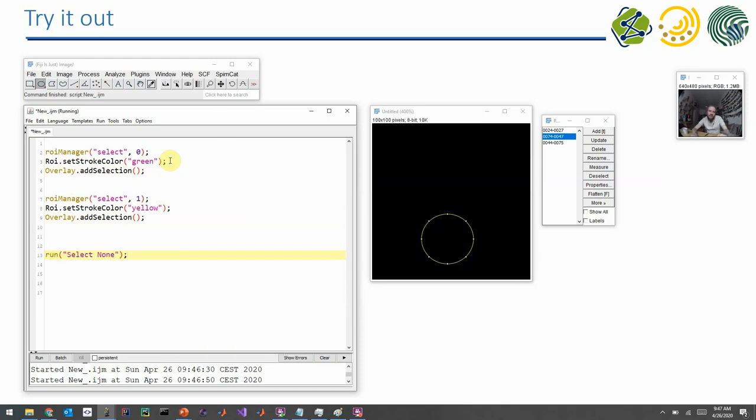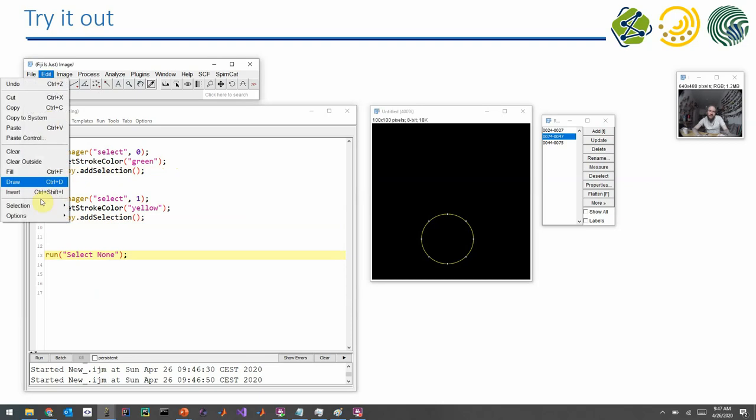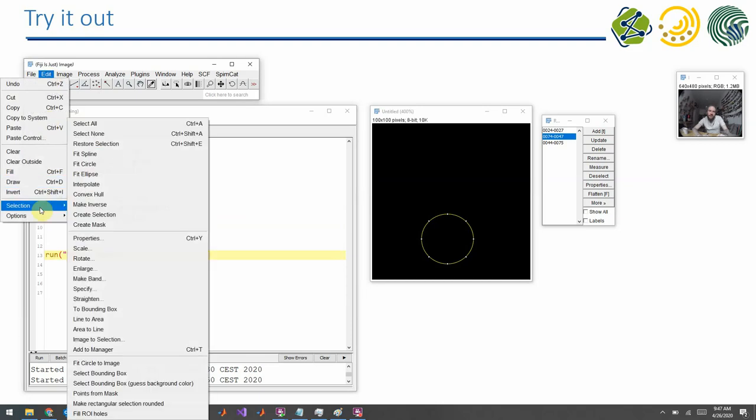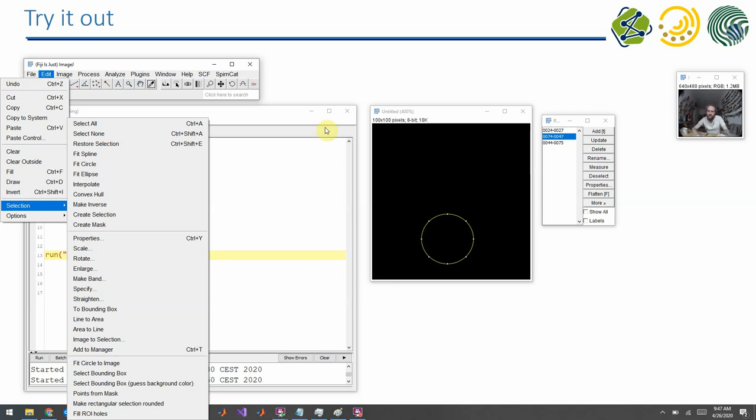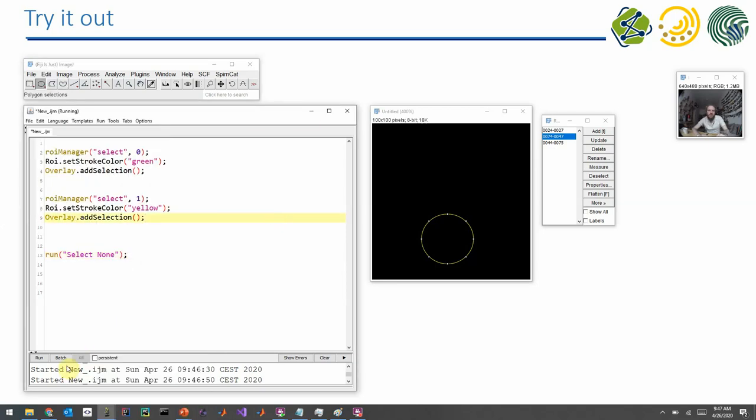It means also by the end of my program, it also makes sense, I can also call the command select none. That actually originates from the menu edit selection, select none. So it's as if I would select nothing in the original image.